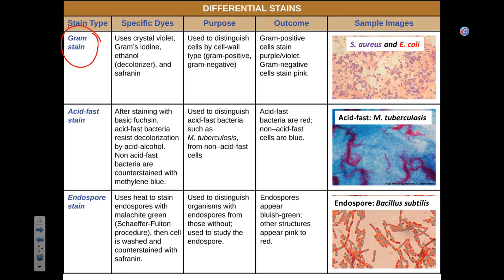Why do I put so much emphasis on the Gram stain? I mentioned before, and I want to reinforce it again. It is a really simple technique, but this is actually one of the go-to methods in clinical microbiology.